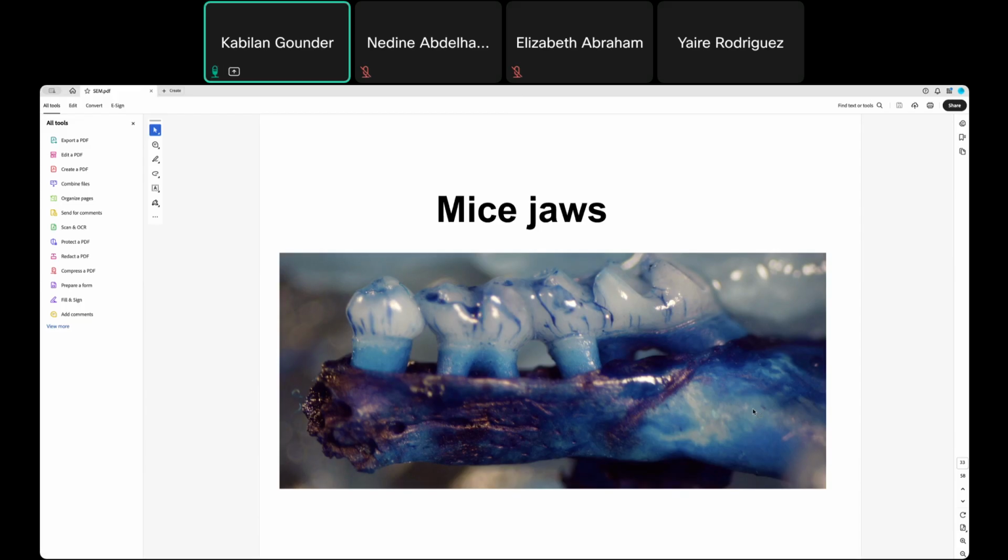So that is what we are going to discuss now. When you look at here, you can see the bone loss of mice due to periodontal disease as well as diabetes, where you can see the detailed bone loss. So it doesn't require the scanning electron microscope to visualize this. The stereo microscope itself shows this area of alveolar bone loss clearly.